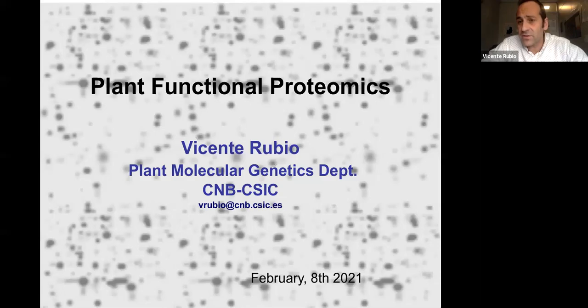The characterization of a particular biological process. In our case, we are a lab dedicated to the study of the function of the ubiquitin system in plants, using mainly Arabidopsis, although we are extending those studies to other systems. Actually, we want to move also to Marchantia to start characterizing the function of that ubiquitin proteasome system in the early land plants and how this system has evolved.